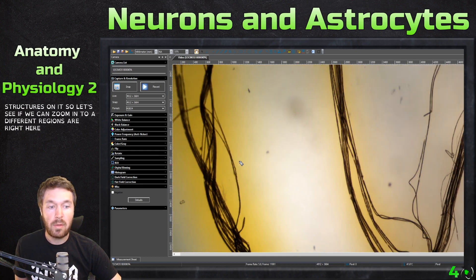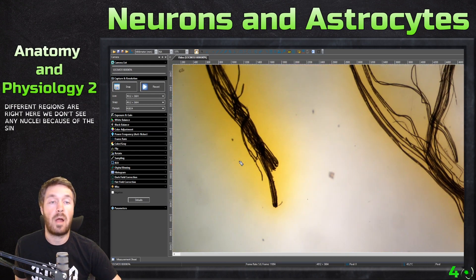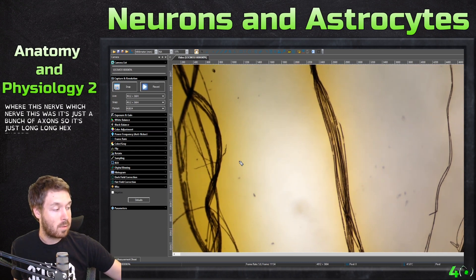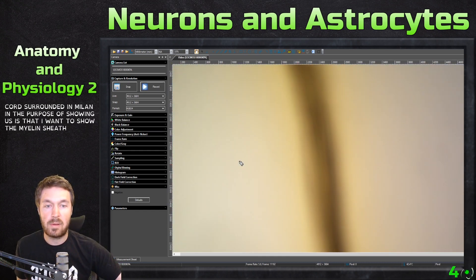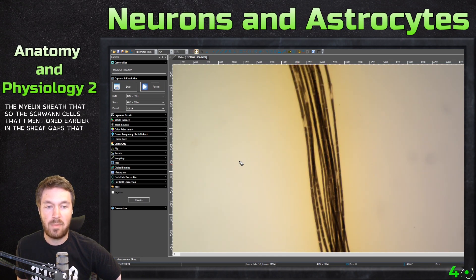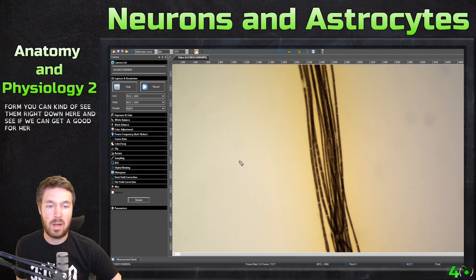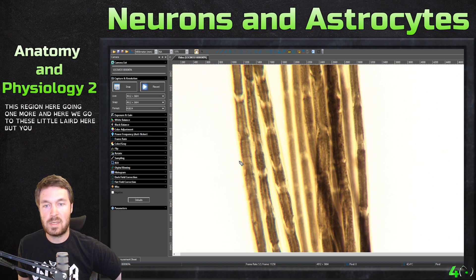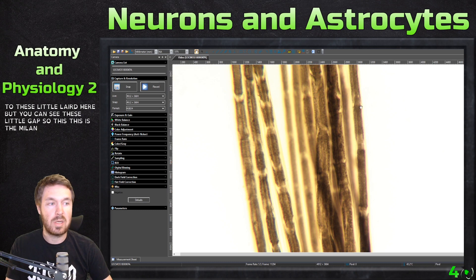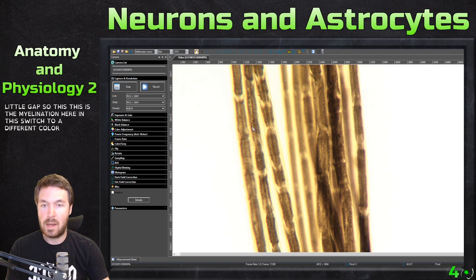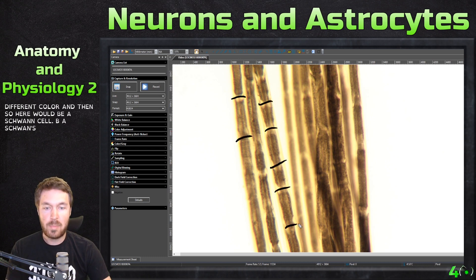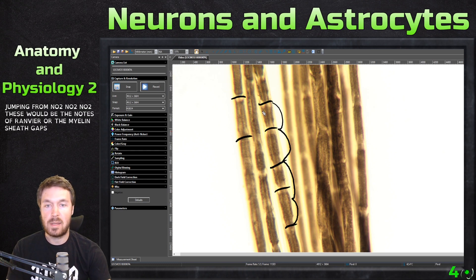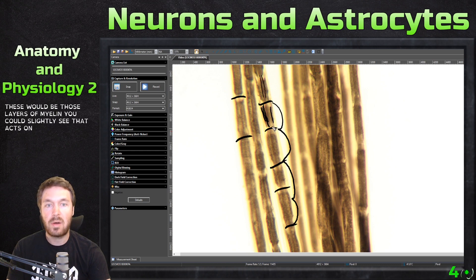Let's zoom into a different region. Right here we don't see any nuclei, because in the center of the nerve it's just a bunch of axons — long axon cords surrounded in myelin. The purpose of showing this is to show the myelin sheath, the Schwann cells I mentioned earlier, and the sheath gaps that form. You can kind of see them right down here. Let's get to 400x magnification in this region. You can see these little gaps — this is the myelination here. Here would be a Schwann cell, here would be a Schwann cell. The action potential would be jumping from node to node — so these would be the nodes of Ranvier, or the myelin sheath gaps. And then these would be those layers of myelin. You can slightly see that axon going right down the middle.